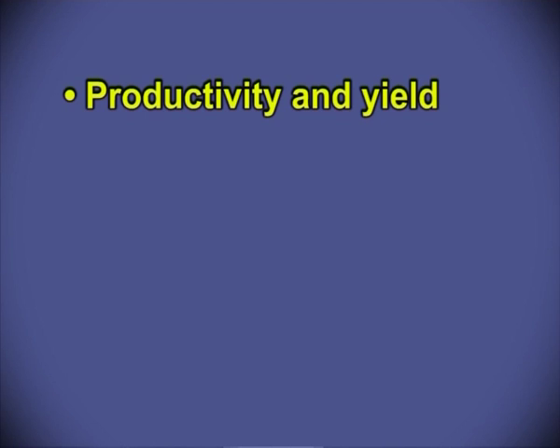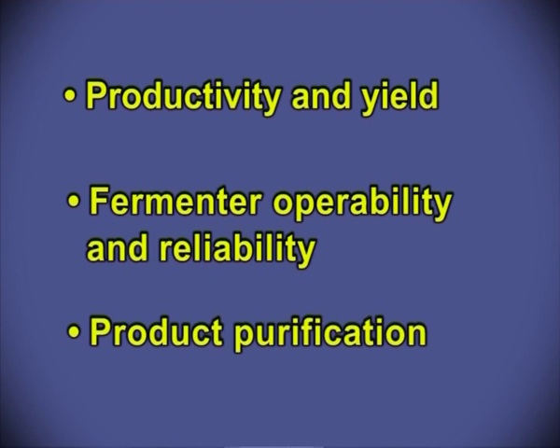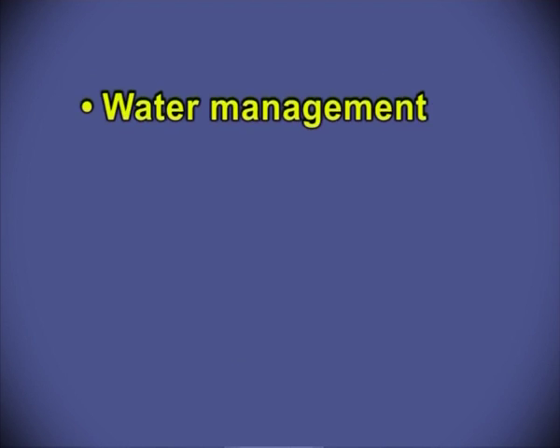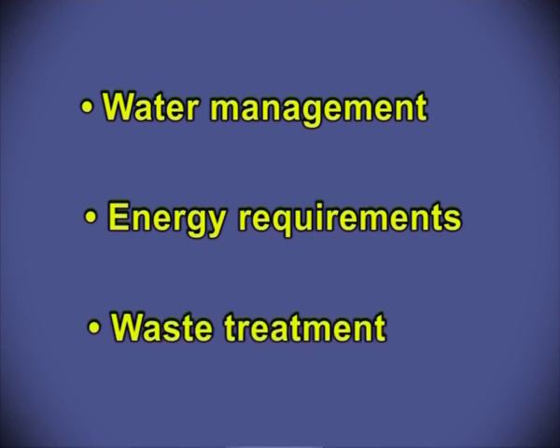Productivity and yield, fermenter operability and reliability, product purification, water management, energy requirements, waste treatment.